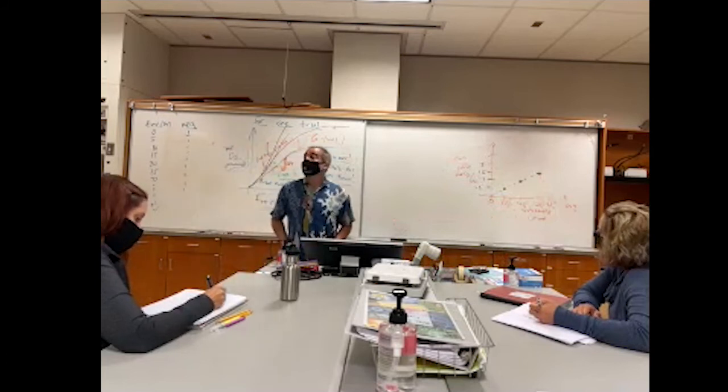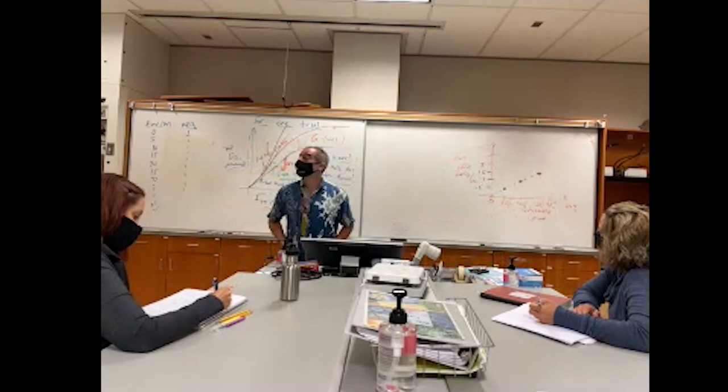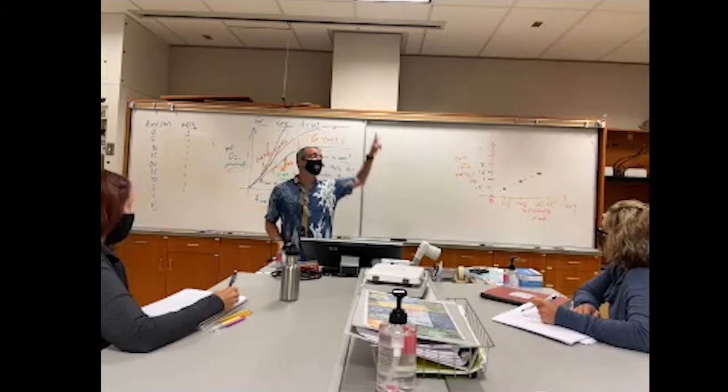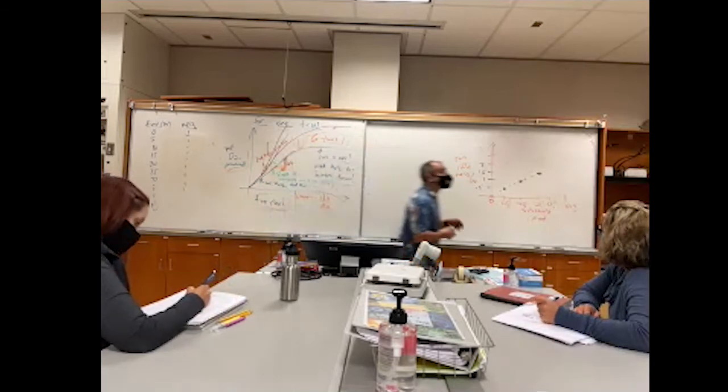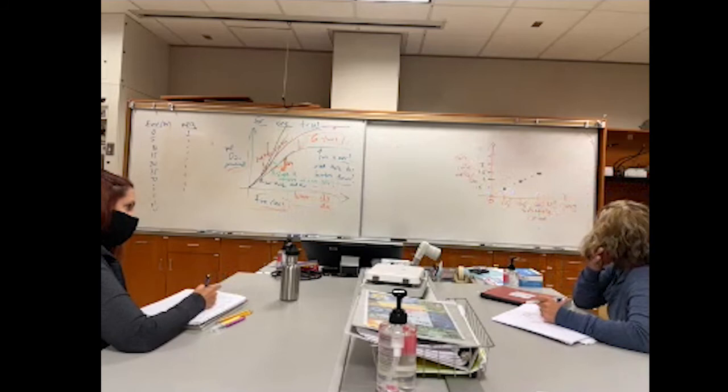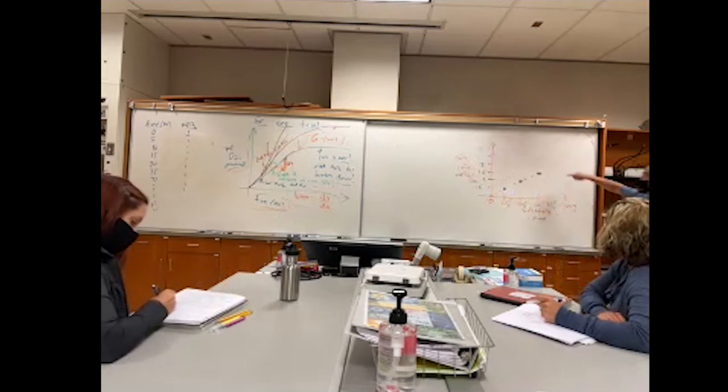What might happen? I know with the thing we talked about, there's a couple of possibilities here, Sienna. The saturation point coverage. Right, so it might be we don't hit saturation. It might be there's plenty of enzymes for all of our trials, in which case we'll just keep going up until we're done.